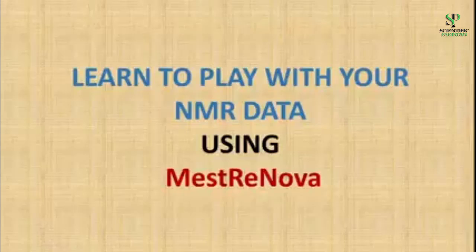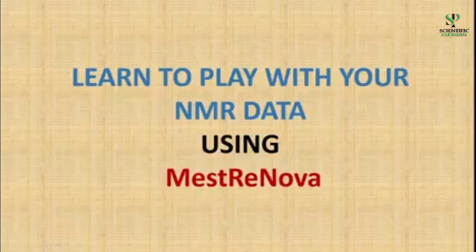Students, we are here with the last session of this course, and in this session you will learn how to play with your NMR data using the software MestReNova. I'll tell you a few details about how to use the software and how to manage your spectral data to get maximum information from it.